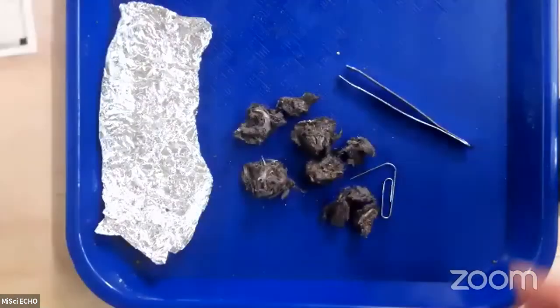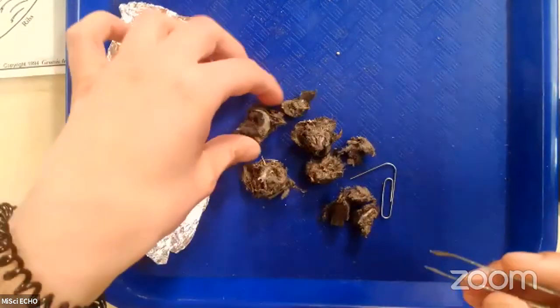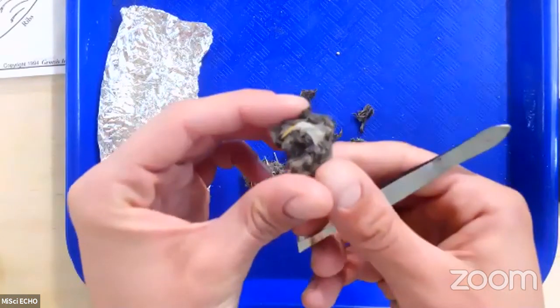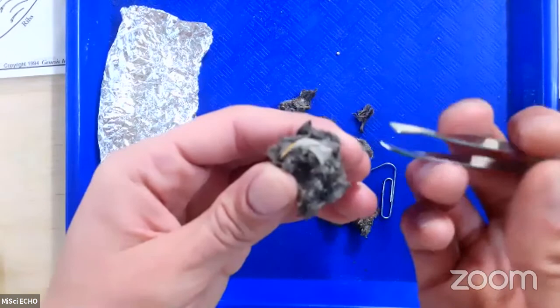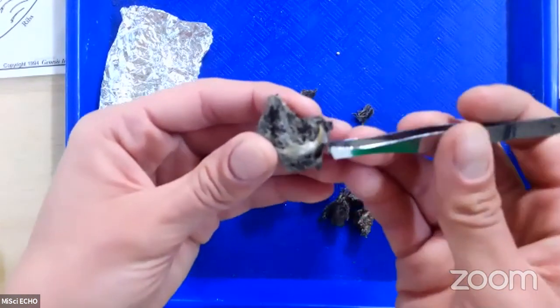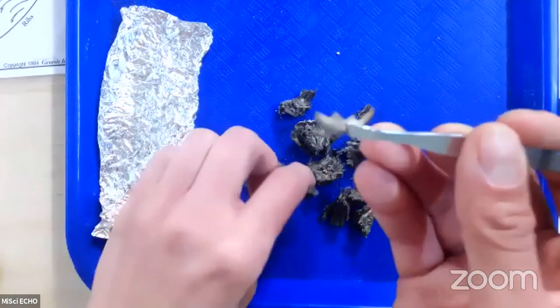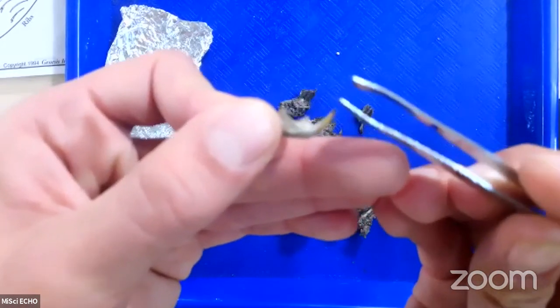All right, so let's get into these owl pellets here. And we said that we can already start to see something very large and very noticeable in some of these pellets. So the first one I'd like to look at is this one right here, because we said the easiest way to identify the food or the organism is by pieces of their skull. And we have a very obvious piece of a jawbone here. It's really easy to tell it's a jawbone because it's got a big tooth on it.